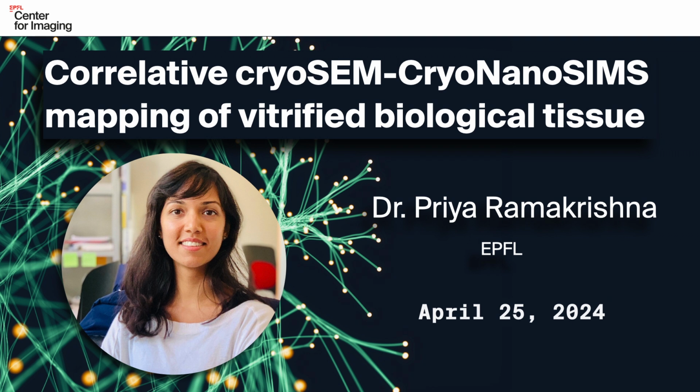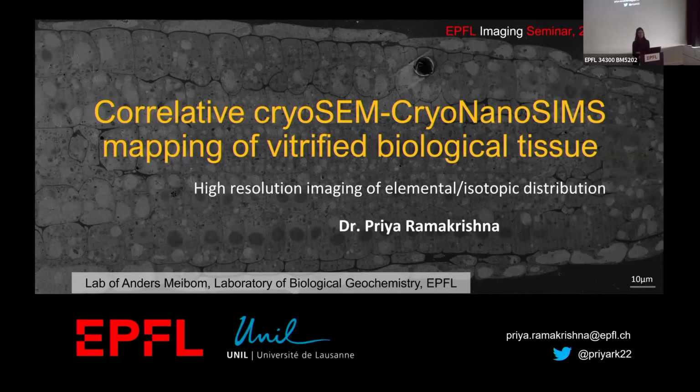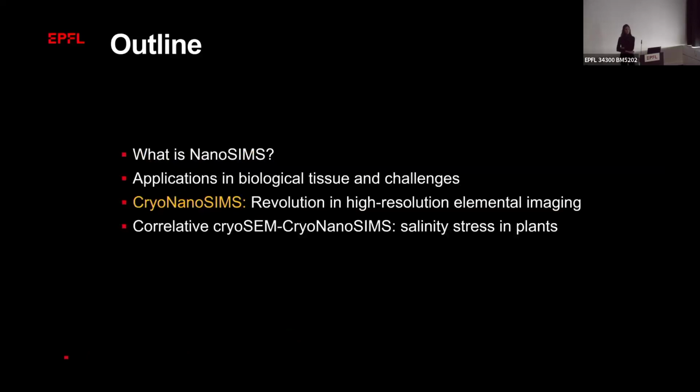I'll be talking to you about this correlative cryo-SEM and cryo-NanoSIMS imaging technique. And as mentioned by Christelle, I'm working in the lab of Professor Anders Meibom at the Laboratory of Biological Geochemistry at the EPFL.